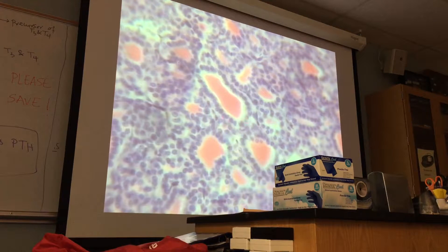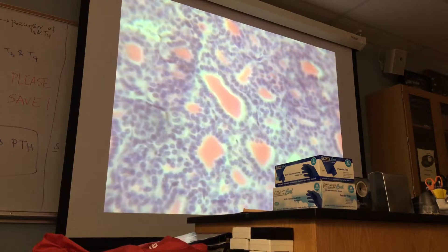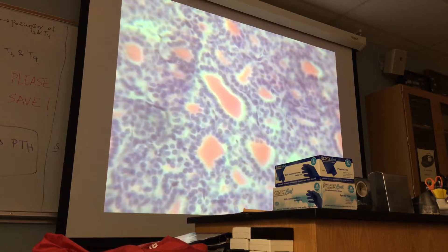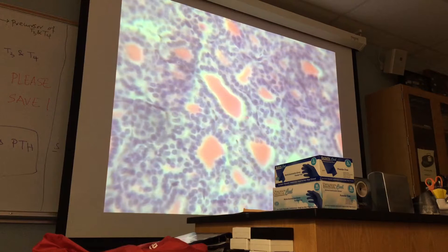When you see the cells in between follicles — like this cell — this is a follicle here, and there are so many follicles. But in between thyroid follicles, you will see parafollicular cells. These parafollicular cells secrete another hormone called calcitonin. So calcitonin, T3, and T4 are thyroid hormones. T3 and T4 are made by follicular cells, but calcitonin is made by parafollicular cells.